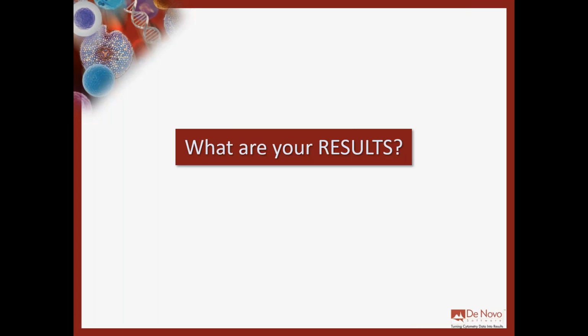The second part of my presentation is more about statistics and numbers. Not really single statistics like the percentage of a gate, but summary statistics, like when you want to combine and compare experimental groups. And the third part is an example of advanced analysis.